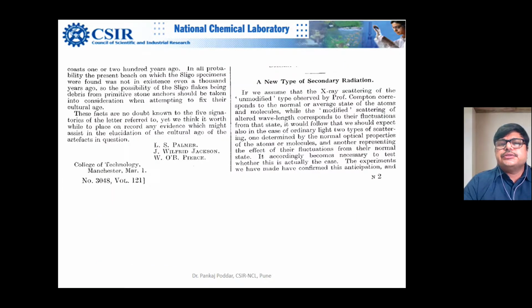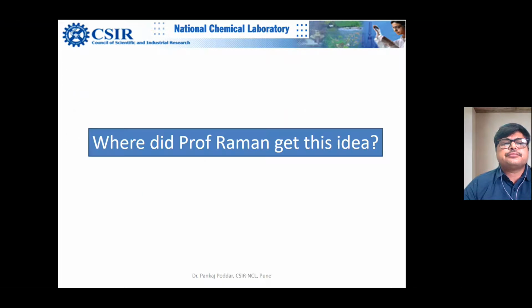So this was actually the paper published by Professor Raman. The title is very short and sweet: A new type of secondary radiation. If you have interest, you can download this paper and read it.